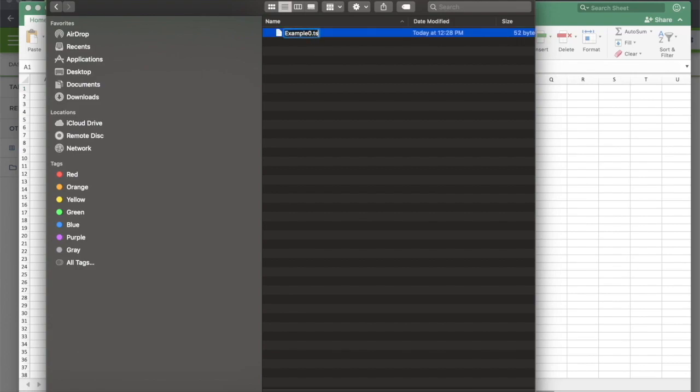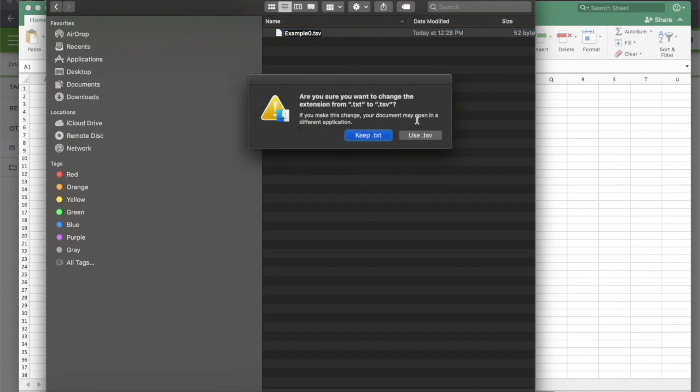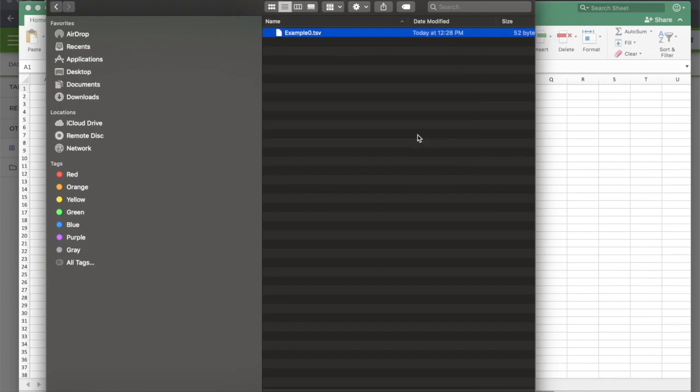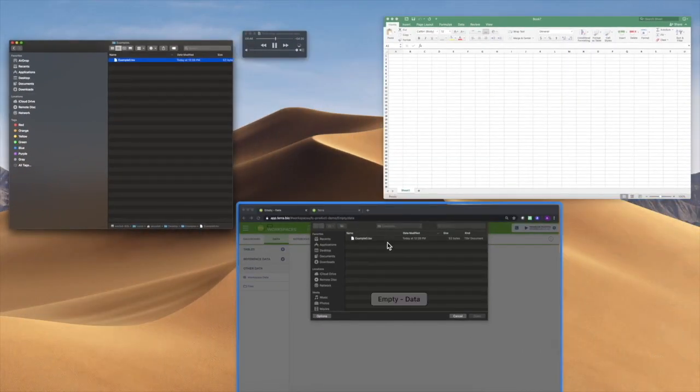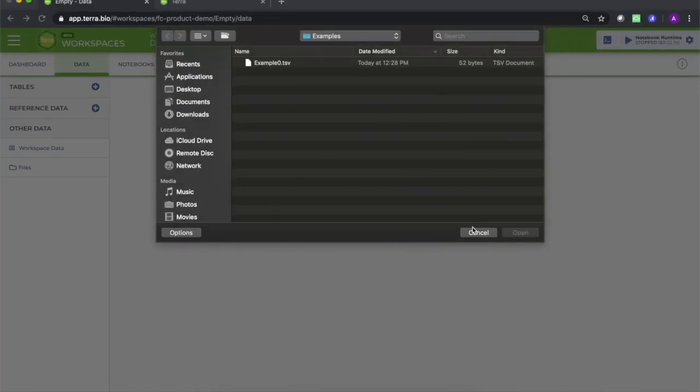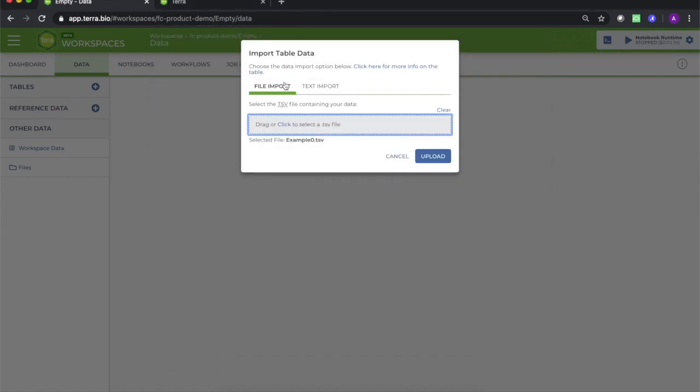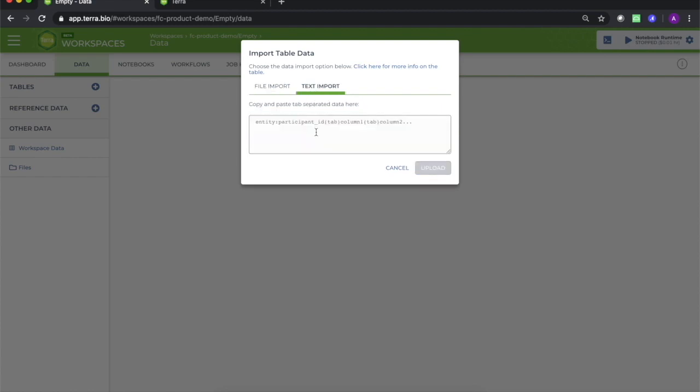Another useful trick to know in case you can't create a .tsv file, but you do have a spreadsheet from which you can copy-paste your desired table structure, is that you can select text import in the upload pop-up window and simply copy-paste a set of rows and columns directly into the field provided.